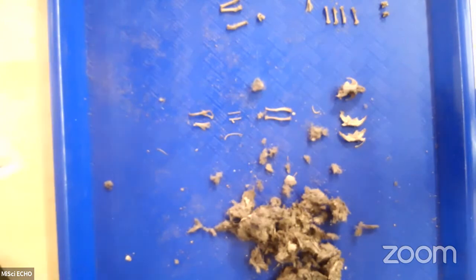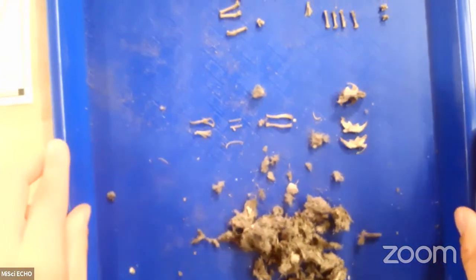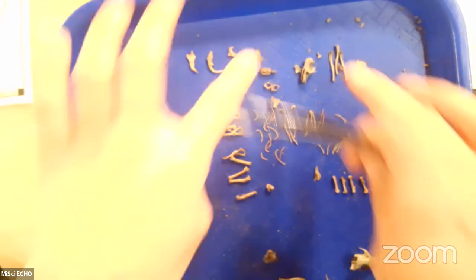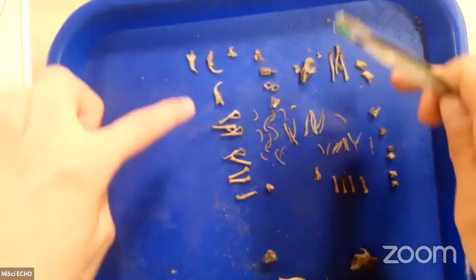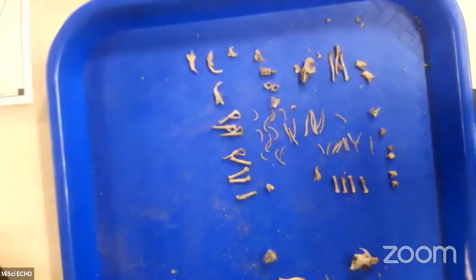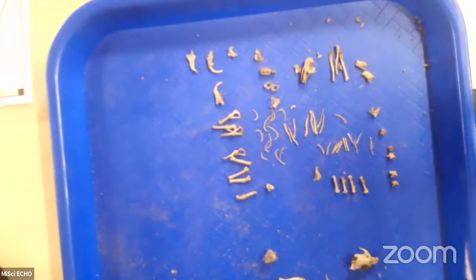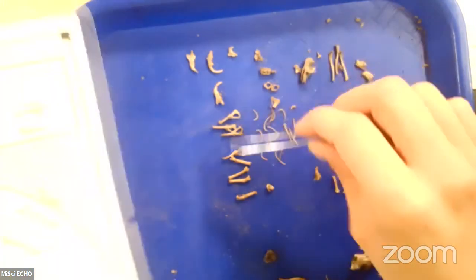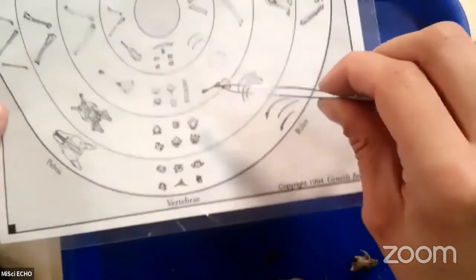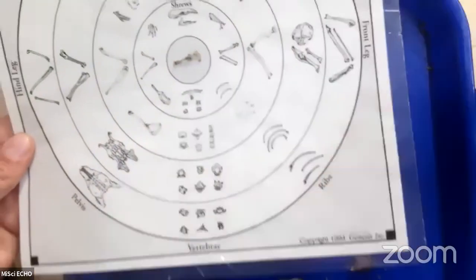Now let's take a look, because I said before the program I've done a little bit of work. What I did is I sorted all of the bones that I was able to extract from one other owl pellet. So everything you see up here came from one owl pellet, though not necessarily from one organism, because let's take a look. We said we'd get to these kind of funny shaped bones, so let's put one up here on our guide, right here in the center.